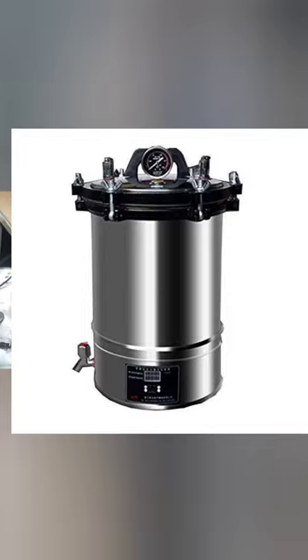As you can see, these are the forms of autoclave machine. So what we'll be doing now is changing the heater of this autoclave machine.